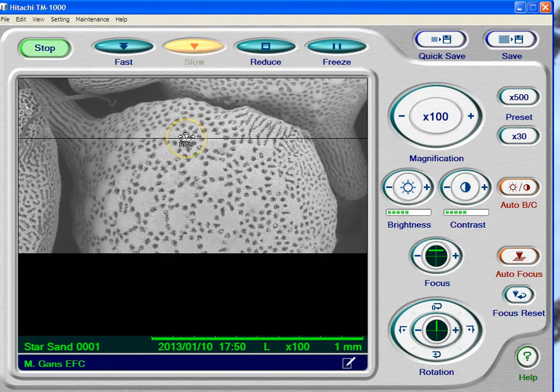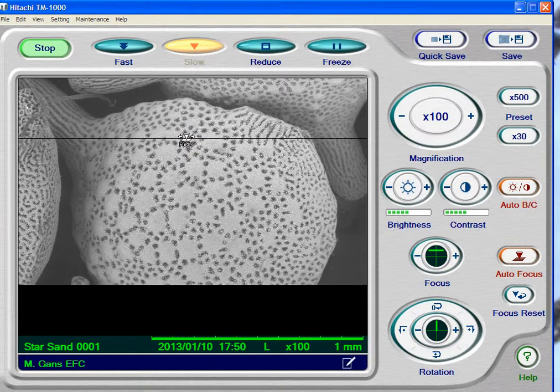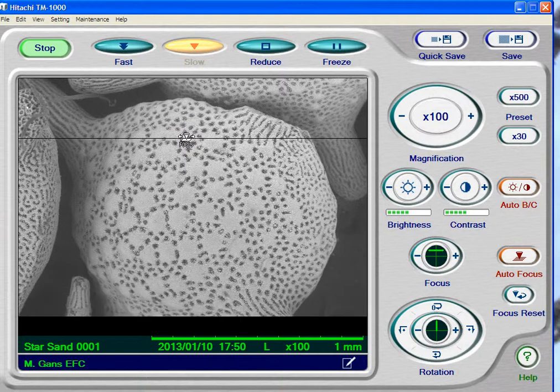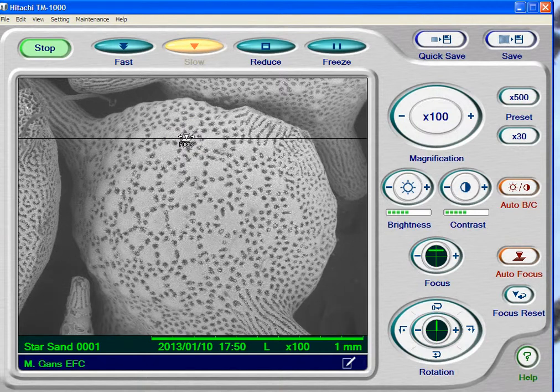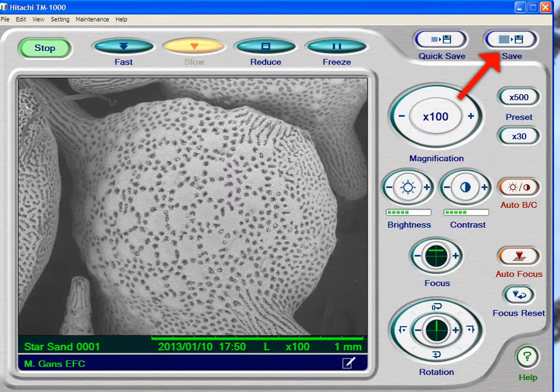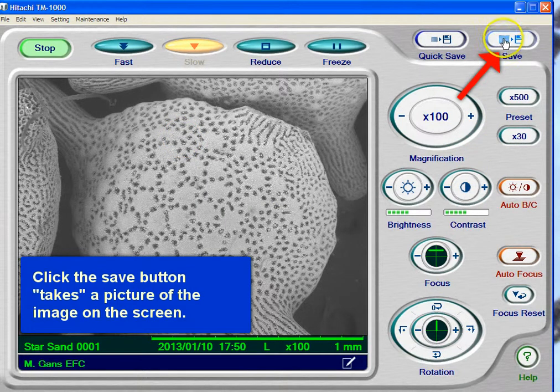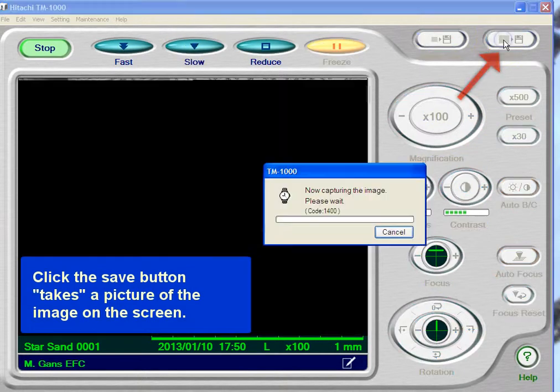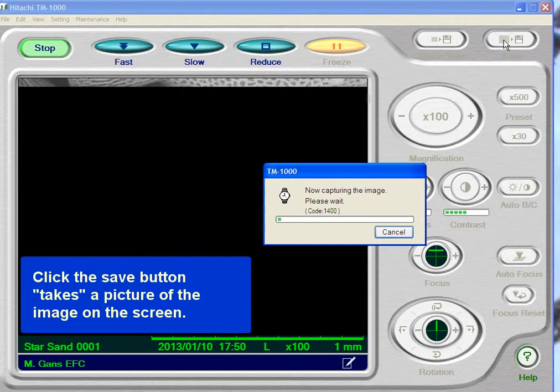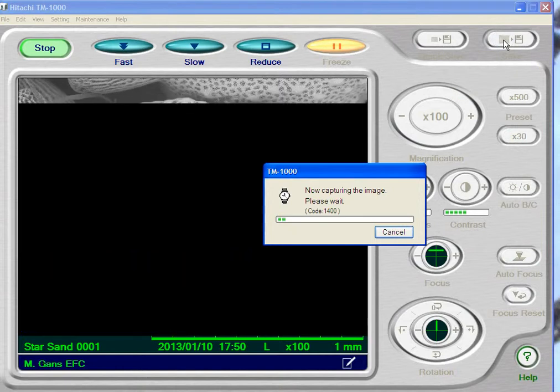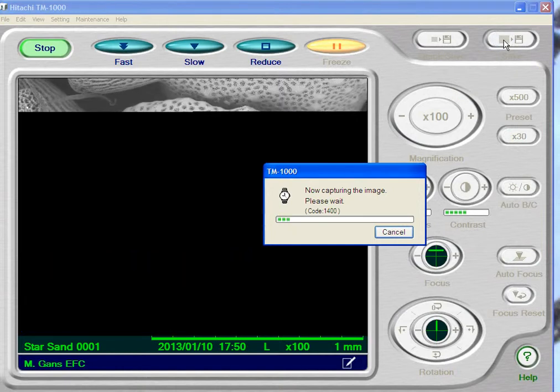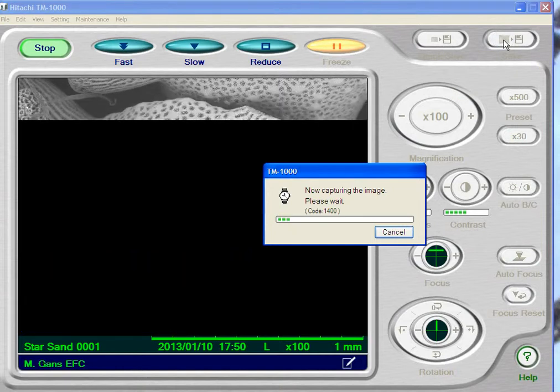That line right there is basically an anomaly where the scope simply did not record a line, but it doesn't make any difference — it'll refresh itself. There, it just went away. So let's go ahead and say we like this picture and we want to take it. Take a picture by clicking the Save button.